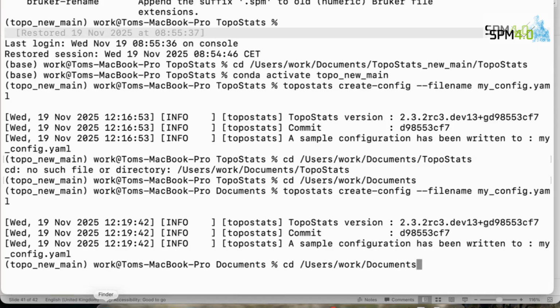So on top of that, it's now installed instead. Do that, then it'll move it, and it'll install it. It might be about 5 minutes still.